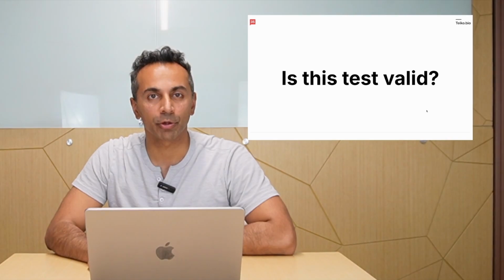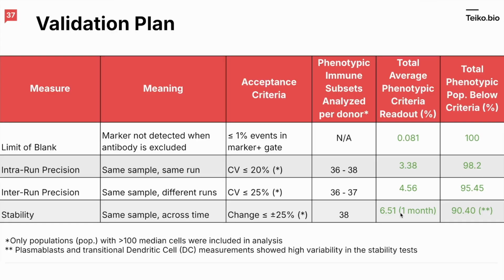So the question from the drug developer is, is this test valid? And the answer is yes. In terms of the validation criteria, we found our test to meet or exceed. The one asterisk here is on stability. We saw plasmablasts and transitional dendritic cells showed high variability in the stability tests, and excluding those, we would pass this plus or minus 25% mark across more than 95% of populations. So the answer is yes.